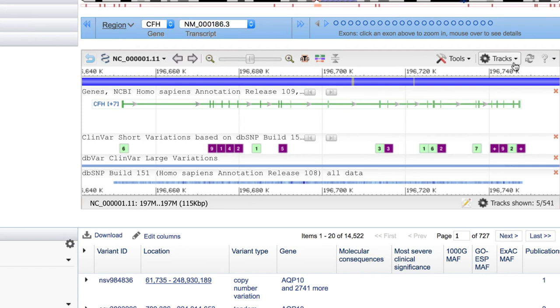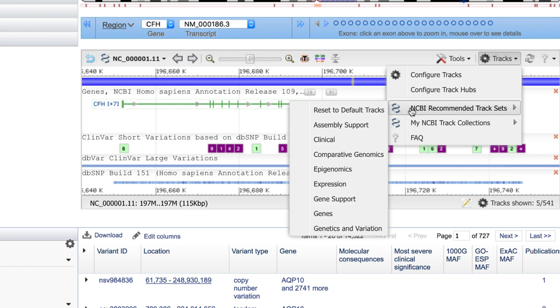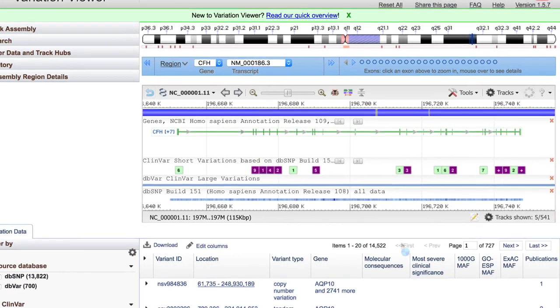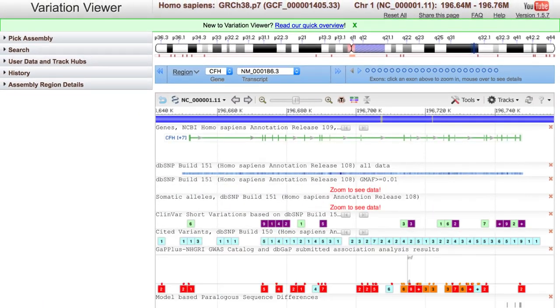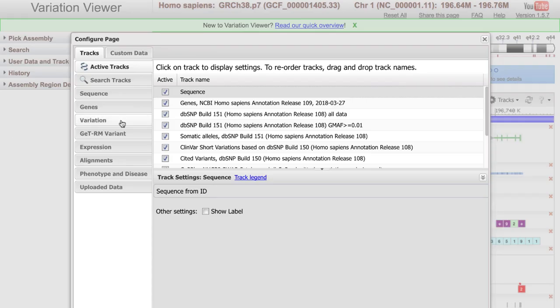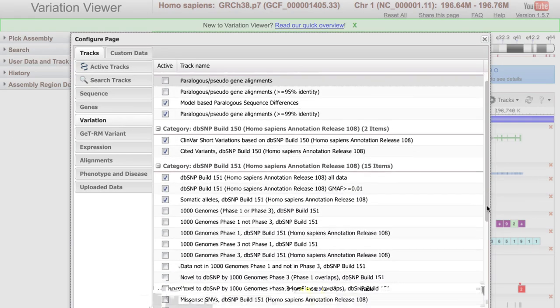So under Tracks, NCBI Recommended Track Sets, select Genetics and Variation. But be aware that there are many more variant related tracks available, from both dbSNP and dbVar data, in the Configure Tracks menu.